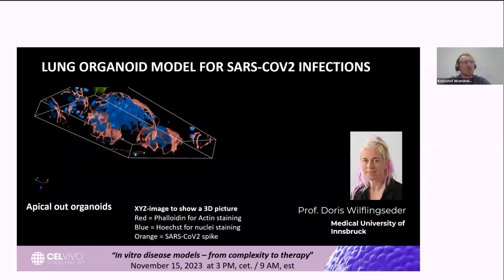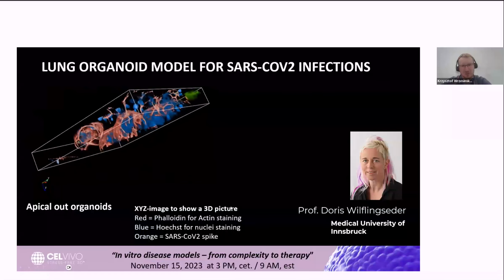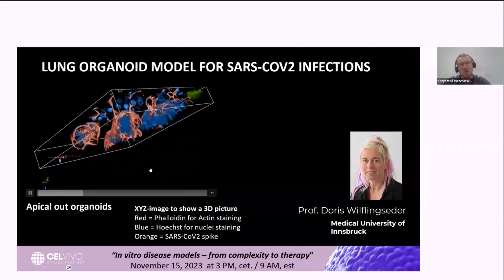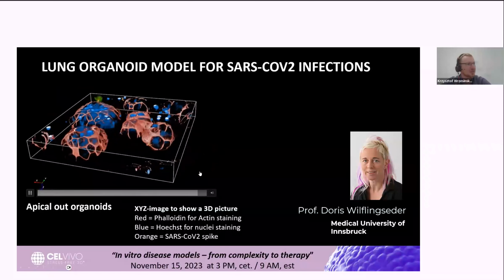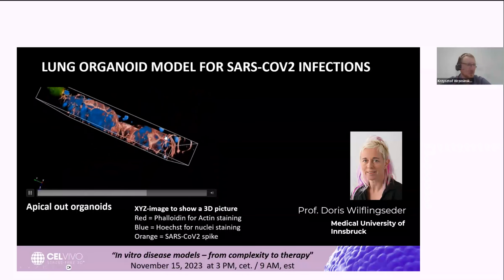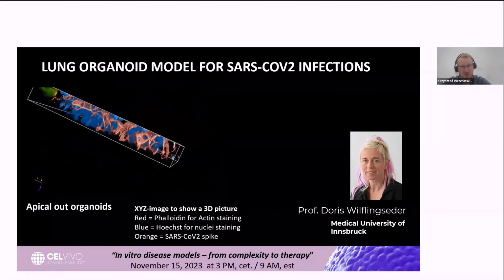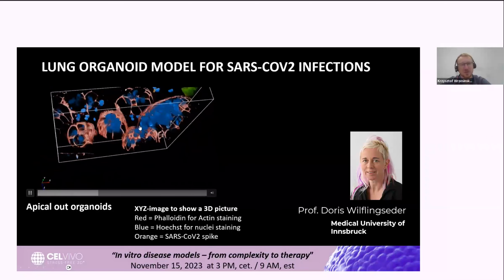Another COVID-related research is actually coming from Professor Doris Wilflingseder's lab from the Medical University of Innsbruck, where they use a lung organoid to study virus infection, or COVID virus infection. I would very much invite you to our next webinar on November 15, when Professor Doris Wilflingseder will be talking about her research in much more detail.